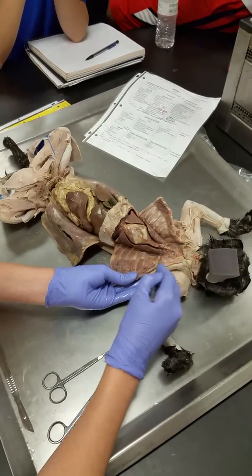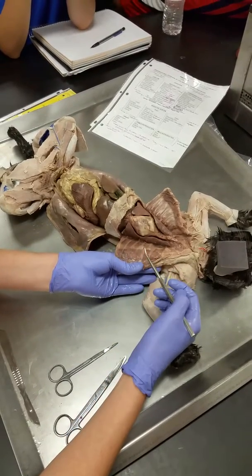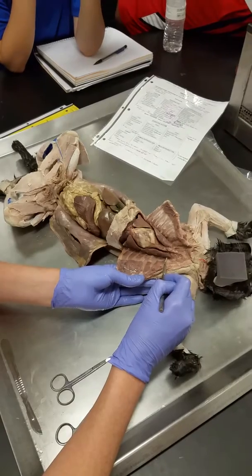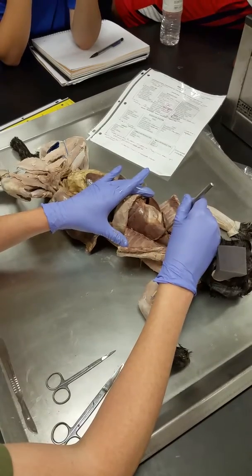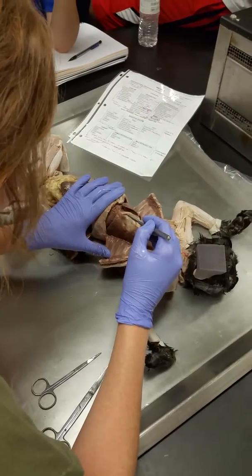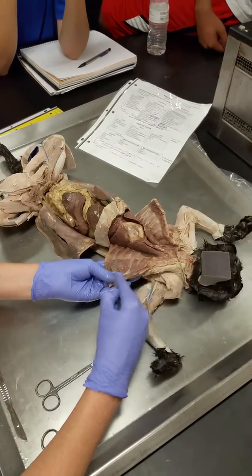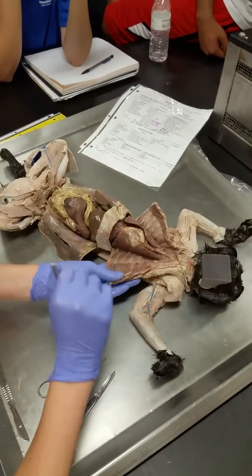Okay. So up here in the thoracic cavity, we have the visceral and parietal pleura. So parietal pleura lines the body wall up here. Okay. And the visceral pleura is lining the lungs. Okay. What's going on in the heart is a little different. I need to cut open the heart too, and we'll look at the heart in a second, okay? But for now, we've got parietal pleura lining the walls, and visceral pleura lining the lungs itself.